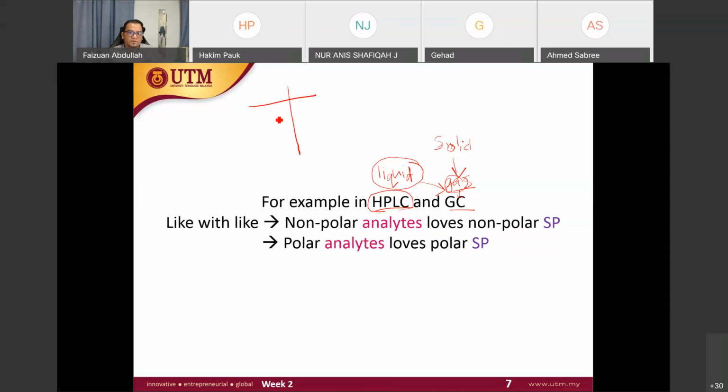The first part is for the... I want you to answer this. The second part is for the detection. And for the first part, previously in spectroscopy, you have what? Atomization, right? For now, what kind of component do we have? Second one is detection. So the first one is what? Separation. Yes, separation, right?